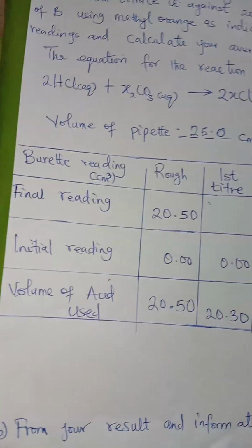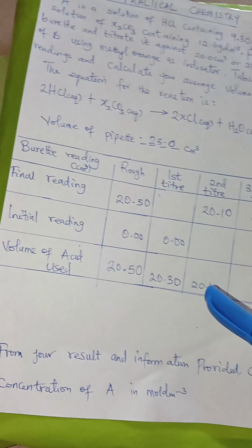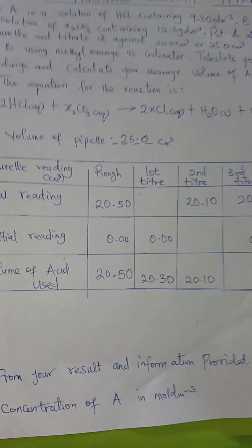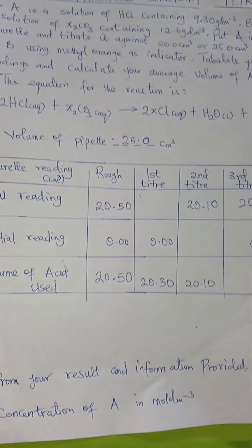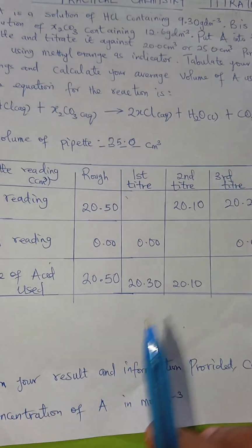20.50. Please, students, be very, very careful in this part or on this table, because any cancellation on the table will attract deduction of marks. No alteration, no cancellation. The neater the table, the better.